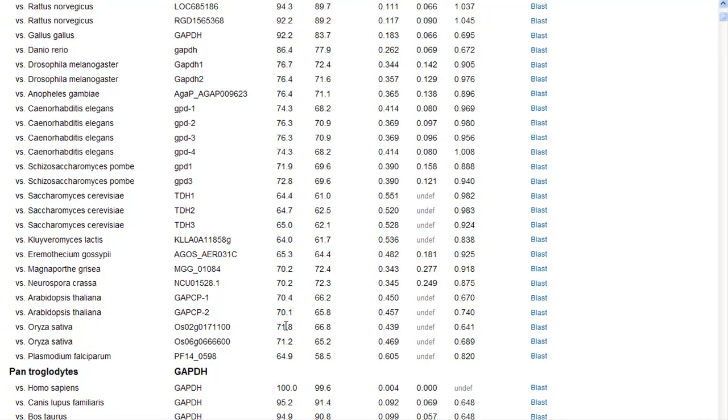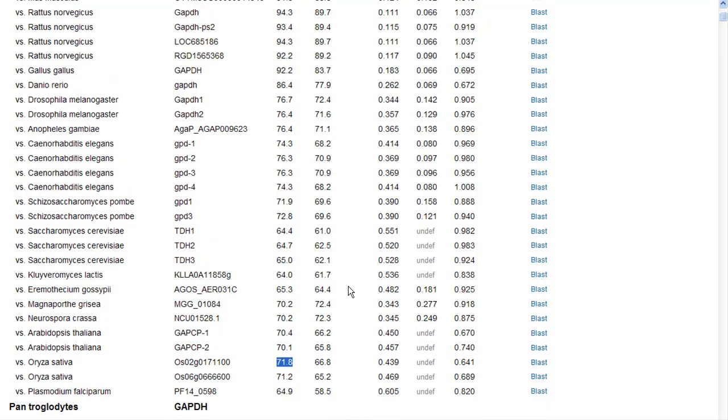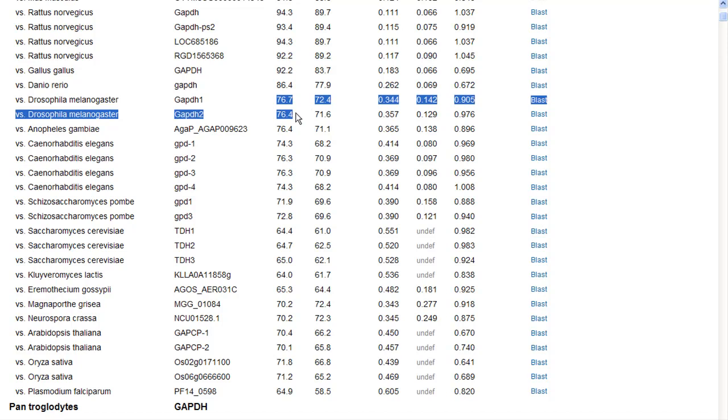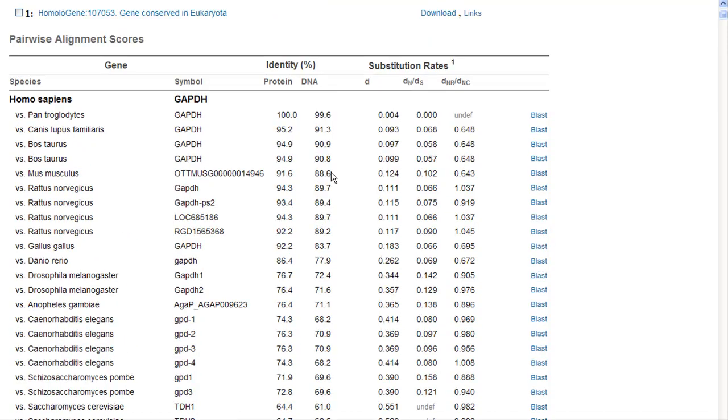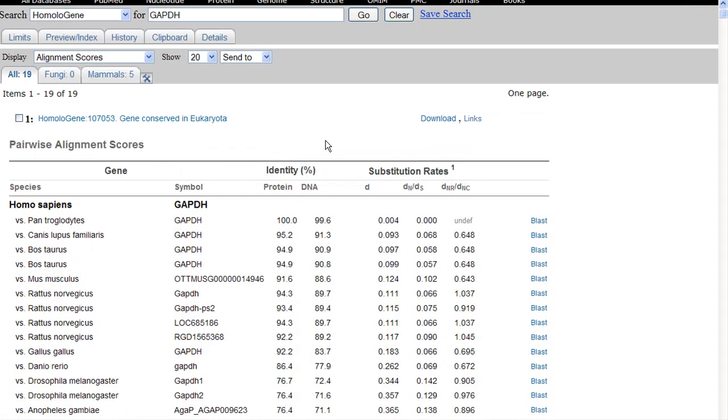So as we go down, we notice that even rice has a 71.8% similarity to the human sequence. But you'll also notice that none of these numbers are essentially the same, except in a few cases. But what we're looking at here is a great deal of diversity in the sequences that are being created.